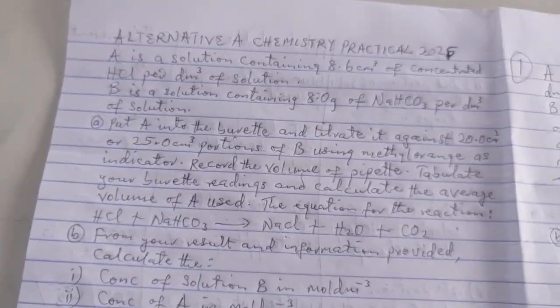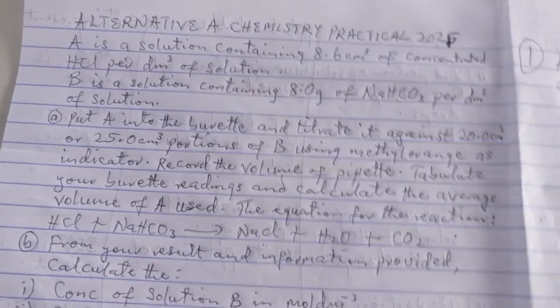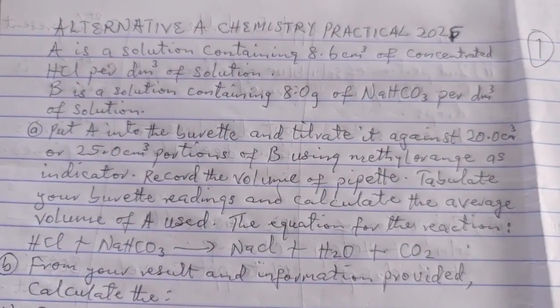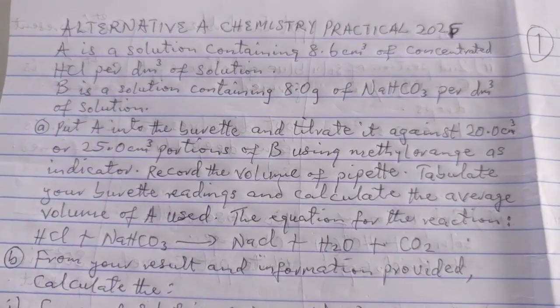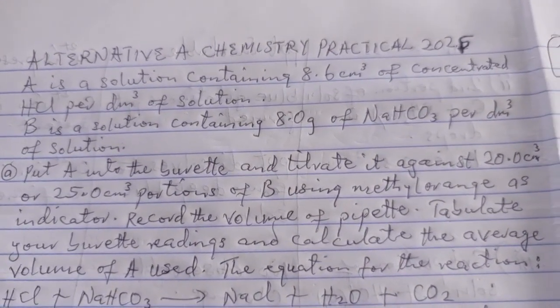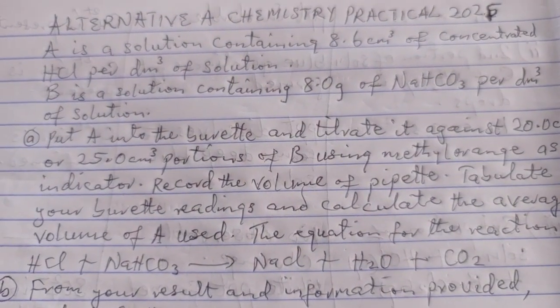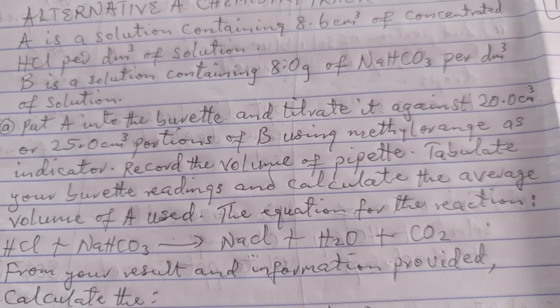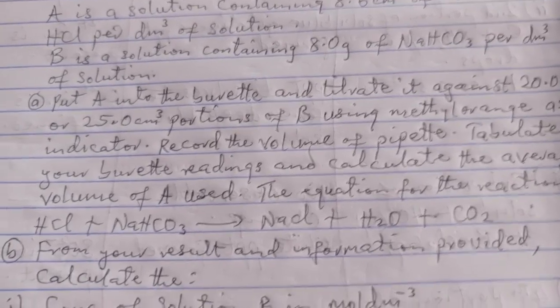So now the question says, A is a solution containing 8.6 cm³ of concentrated HCl per dm³ of solution. B is a solution containing 8.0 g of NaHCO3 per dm³ of solution.